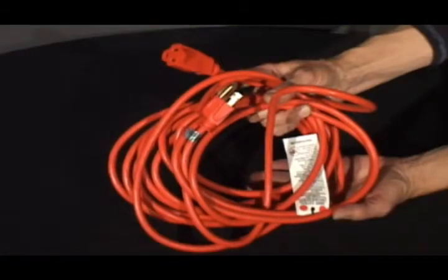You don't want any moisture to make it in that bottom hole, so it is fine to use tape to seal off any open space around the extension cord. Plug your extension cord into an outdoor AC source and run your Dust Track as normal.